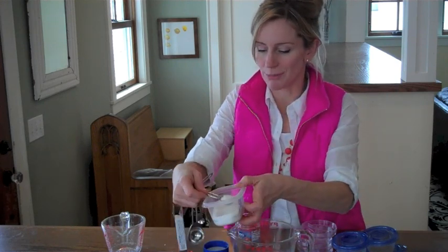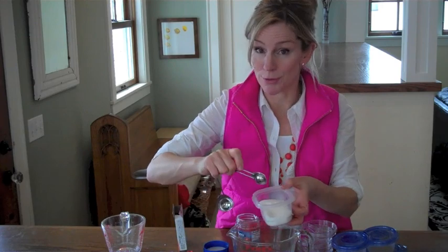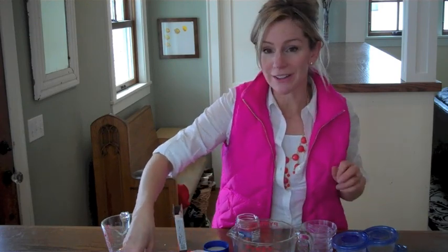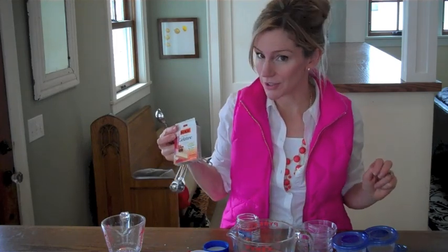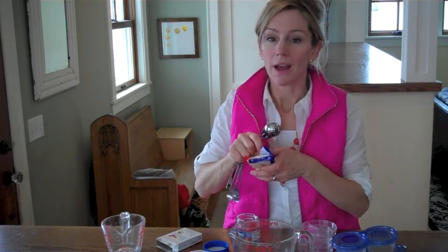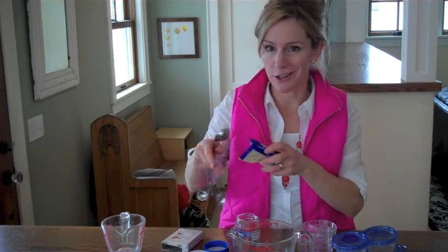The sugar and the bouillon cubes are some of the food that we're feeding our microorganisms. Finally, you want to add either one and a half packages of plain gelatin or a tablespoon of agar-agar.